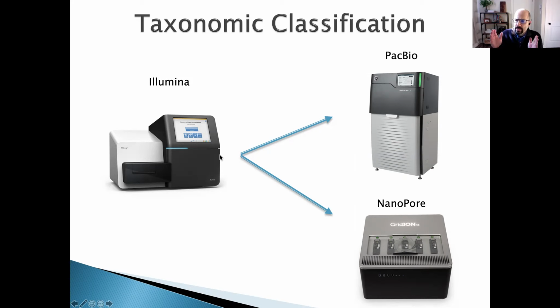And now with the long read, you can go there, compare to the full 16S gene and say, this is 100% matched with a Prevotella, whatever species, or with Clostridium perfringens. Okay, and I can be sure that I'm talking about Clostridium perfringens and not any other Clostridium that might be there. Is that clear? Yes, good.